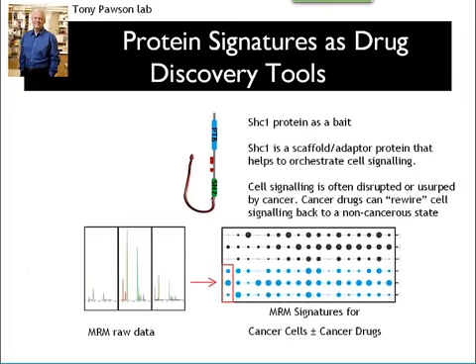We're going to do something a little different. We're going to be quantifying proteins, and these proteins are going to come from protein complexes. And the idea here is that if we just want to do proteomics on blood to look at cancer, blood is extremely complex. There are so many signals that it may be very difficult to tease out what's different between a normal cell and a cancer cell.